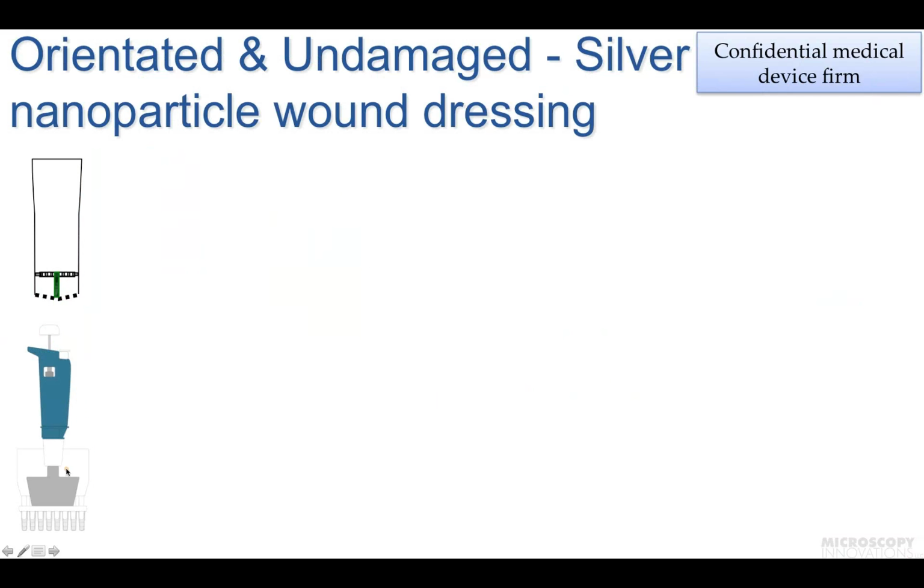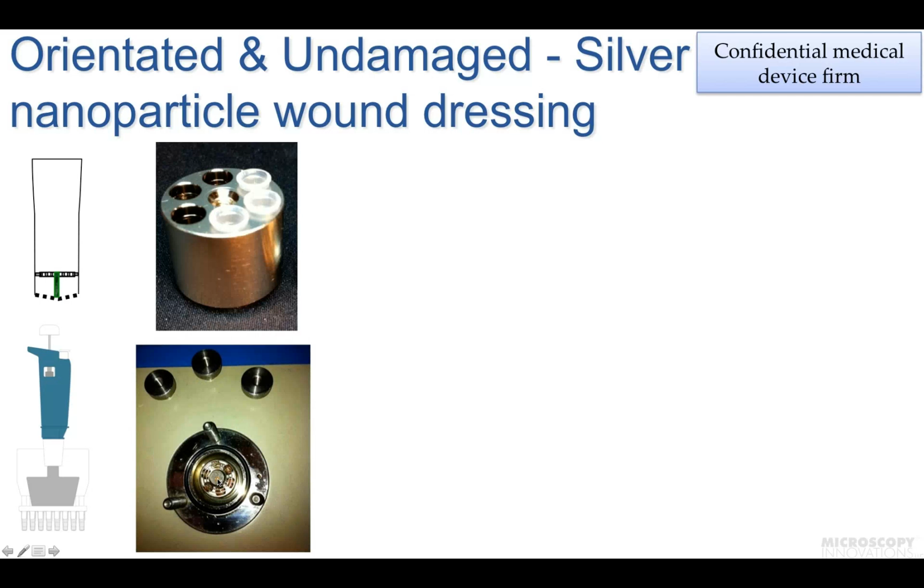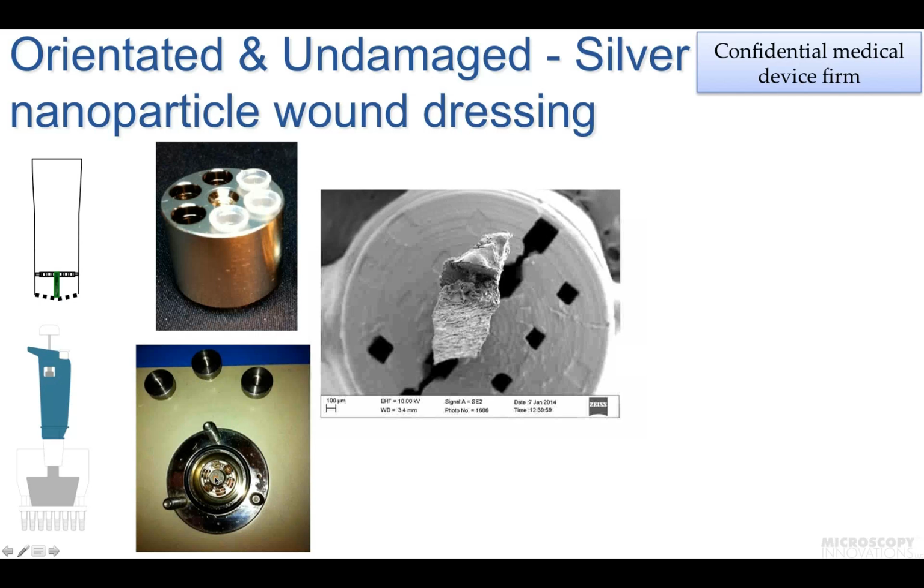Samples were mounted and processed with an 8-channel pipette. Six specimens were done because that's the capacity of the mPrep S holder that fits into the TEM critical point dryer, as we see it sitting in here, ready for processing. And here's one of those samples that's been mounted. So here we have a tissue sample that's pinched in the screen. And here we see the screen, and we can see that some of the holes that are used for the fluid reagent delivery have now been covered up by the conductive paste, and some of them have been made smaller by it.